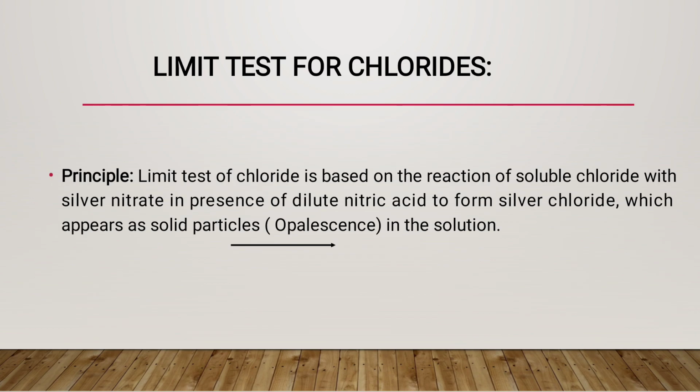The limit test of chloride is a test for the identification of impurities in the form of chloride in a pharmaceutical substance.